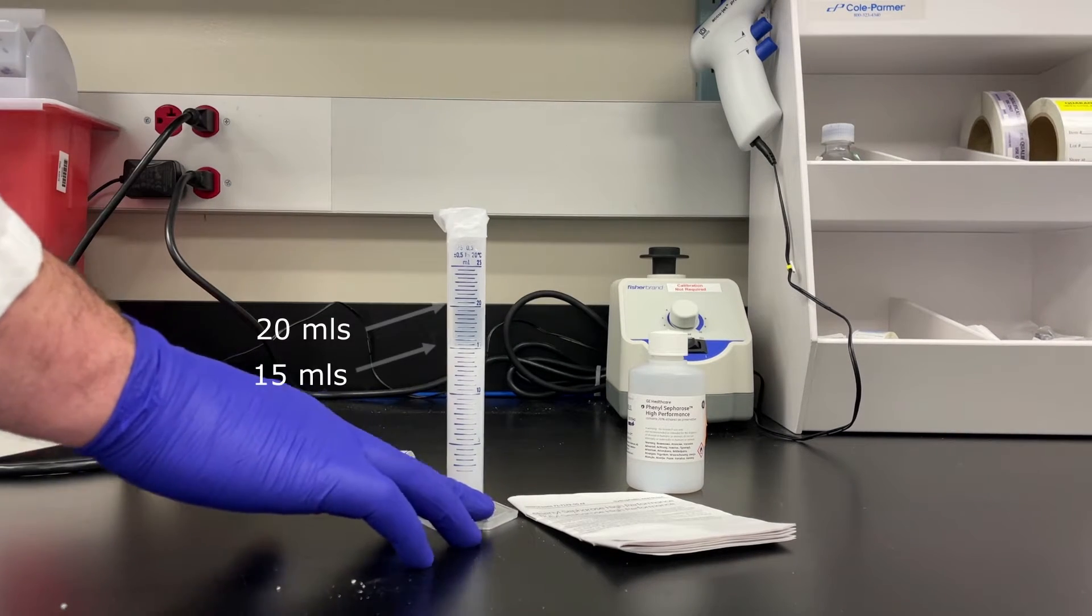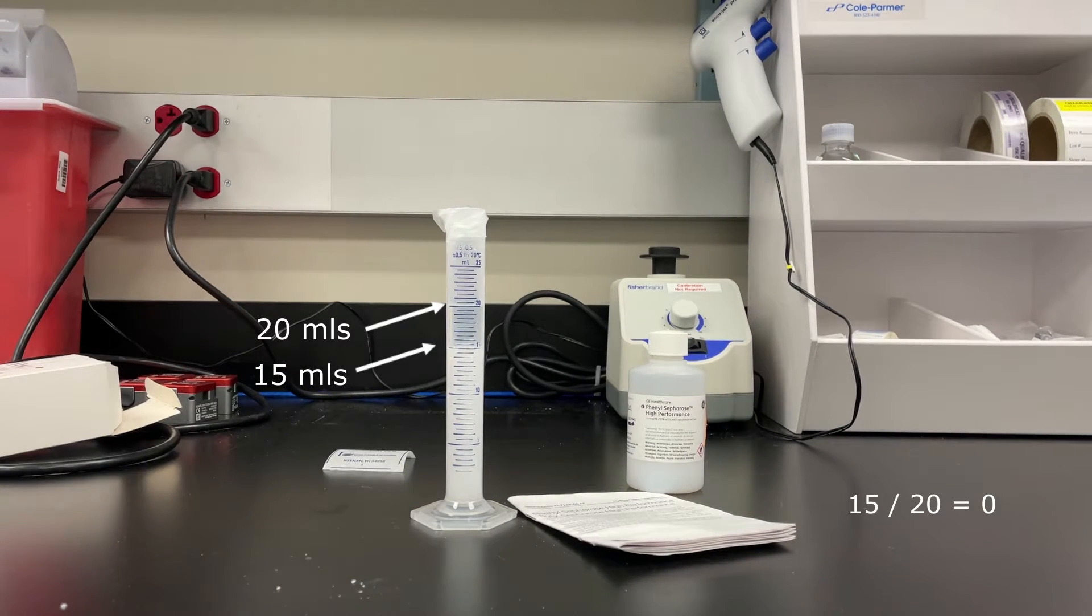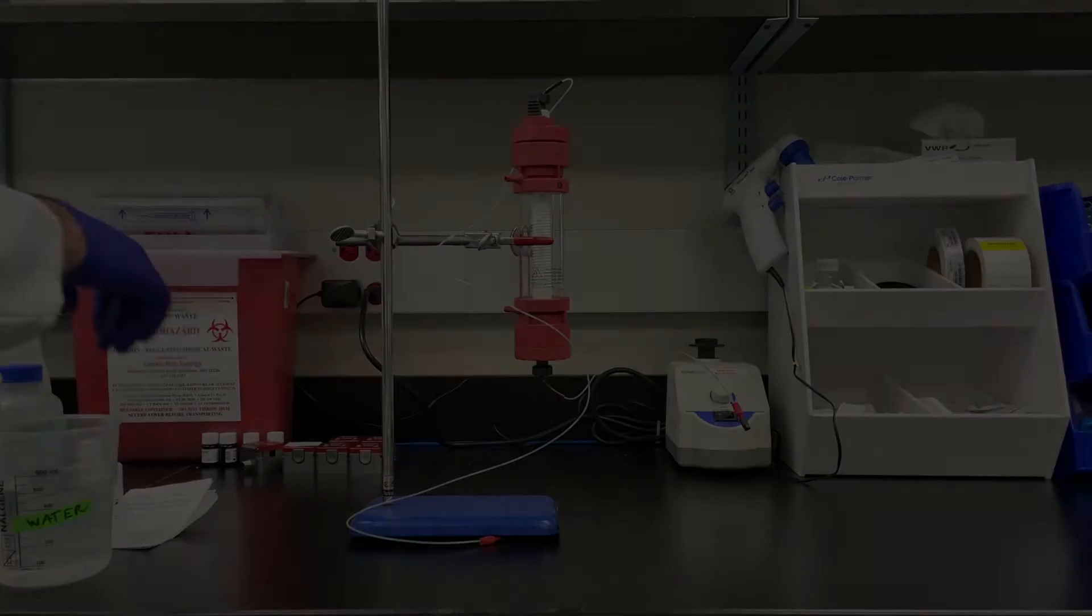The graduated cylinder sat overnight. We can see that the resin settled to 15 mils and the liquid is up to 20, which means it's a 75% slurry.